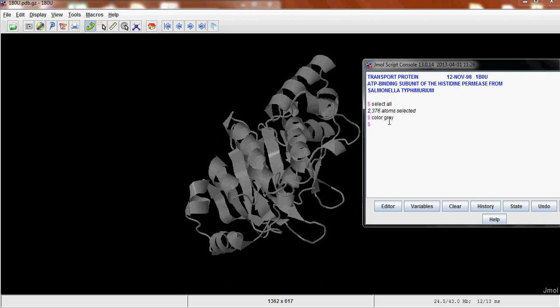And you can select just the parts that you want. So motif A is from 39 to 46. And then we can color this, let's say, blue. So this will show up here.